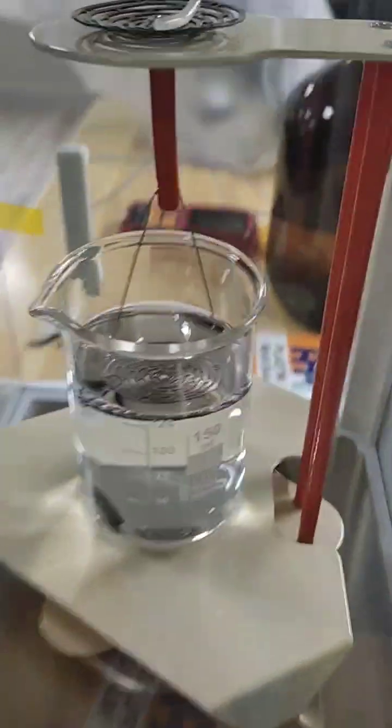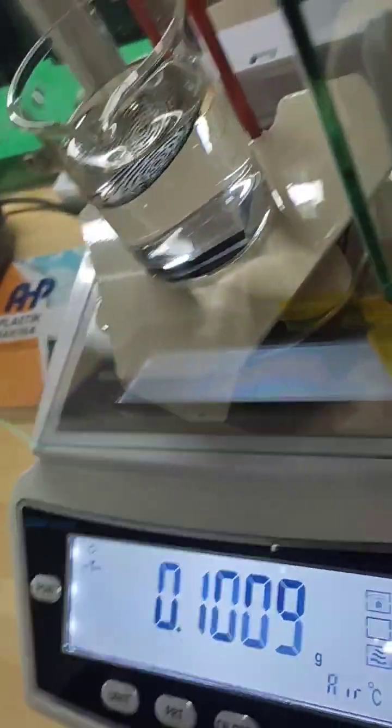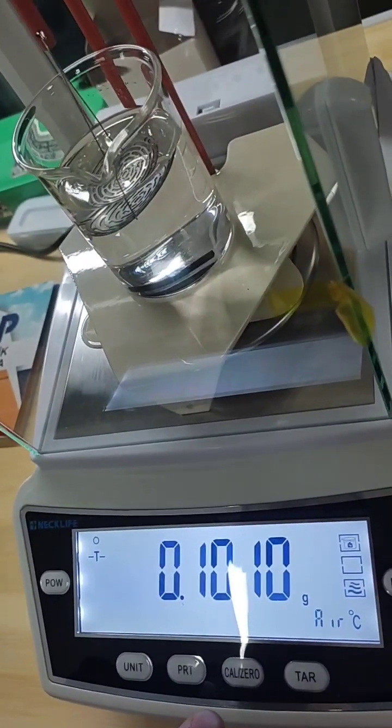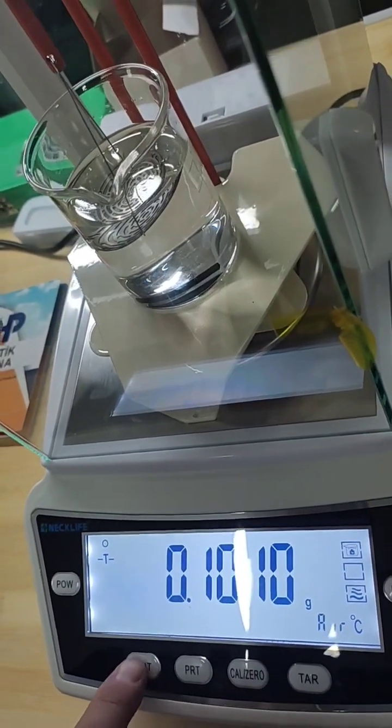Then place the sample weighted in air. Wait for the digit to be stabilized. Then click on unit.